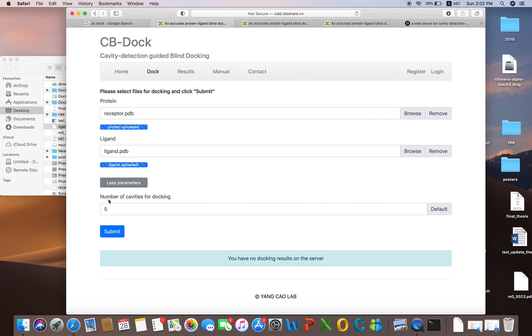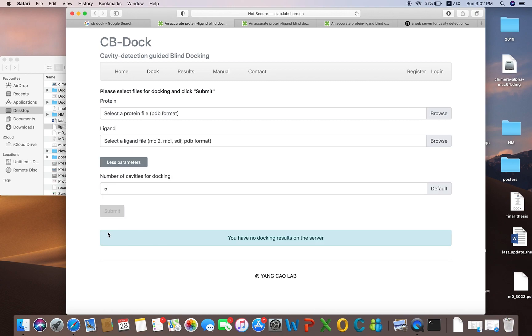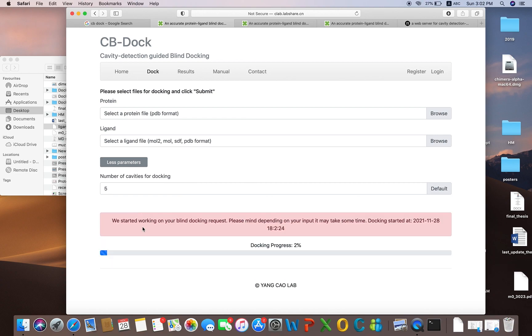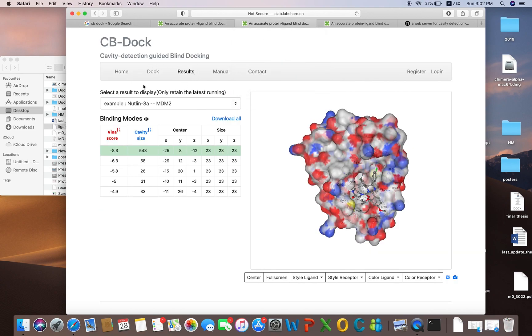This is the parameters tab. If you click here, it shows the number of cavities for docking — in how many cavities you want to dock your ligand. By default it is five; you can type 10, 15, 20, or whatever you want, but we will go with the default. After that you click Submit. The docking progress goes from 2% to 5% to 10% to 20% — it will take two to three minutes to complete.